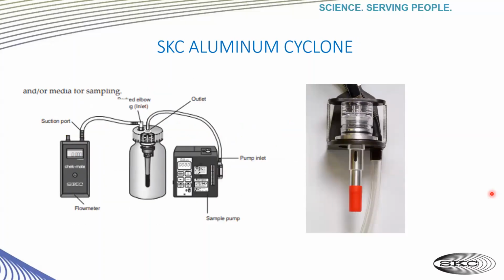The aluminum cyclone that we manufacture has a calibration adapter. However, a lot of other cyclones, including 2 of our own models, do not have calibration adapters. So you may have to use the calibration jar to perform your flow settings and flow verifications. This creates a significant area of added difficulty and, more importantly, an area for mistakes or leakage during the flow verification process. We would really, really like to totally alleviate the need for the infamous calibration jar. I will show you how the PPI can point us in the right direction to achieve that.